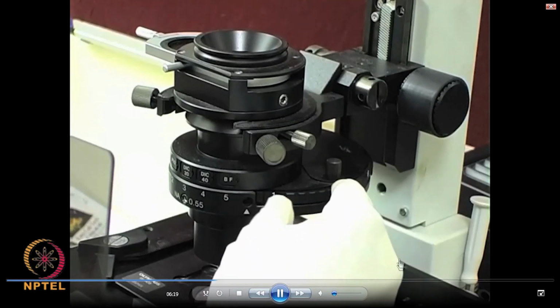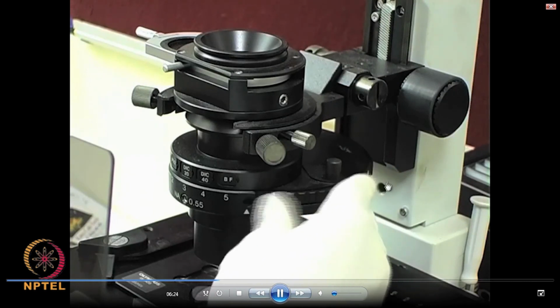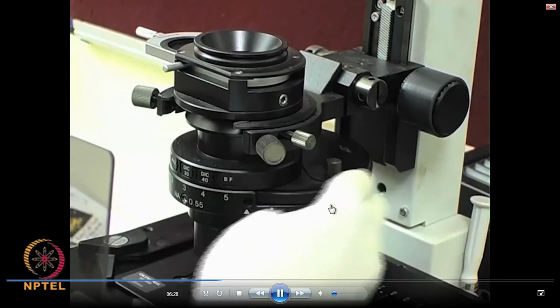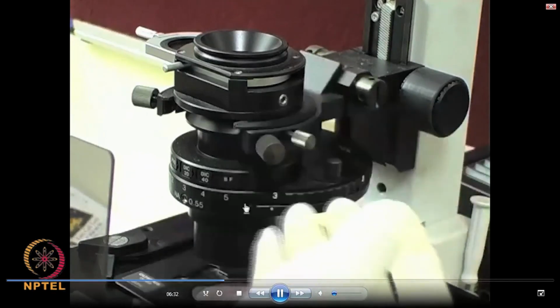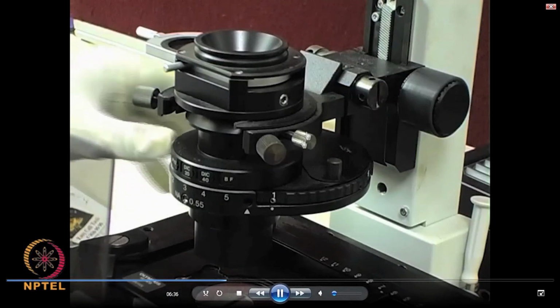You also have condenser aperture lenses with different slots. I will talk about it much more elaborately in the next class. Thank you.